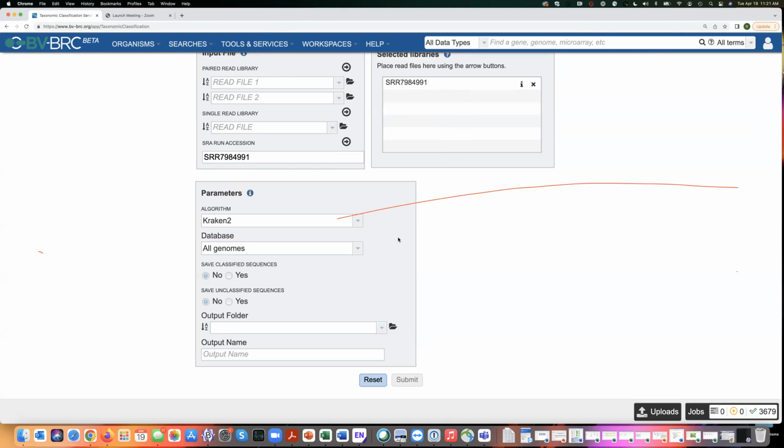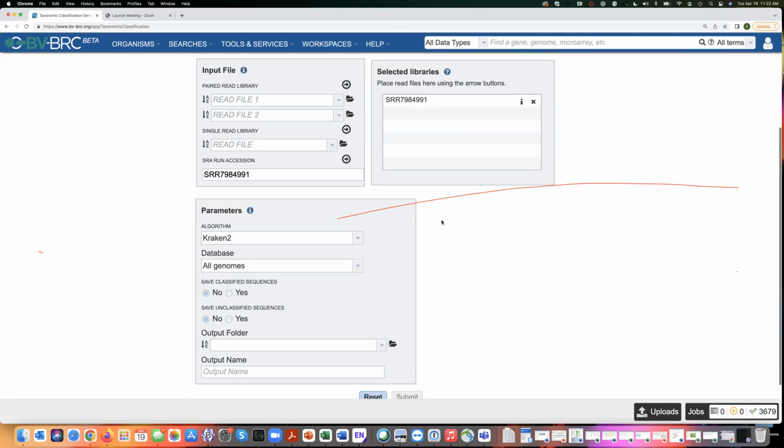Okay, so the answer basically is that there is a way to do it using the command line, but the web interface is underdeveloped. You can do it 192 times, which would be absolutely painful. The easy way in the web interface is under development. Hopefully it will come at some point, but for now, yes, there is a command line option if need be.